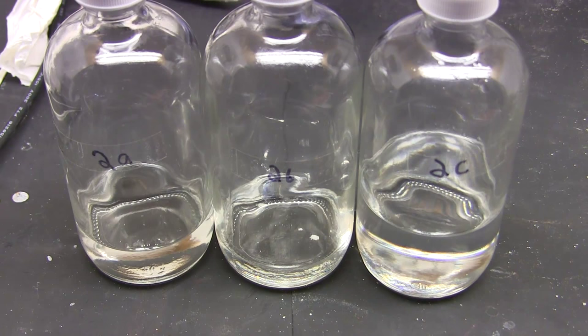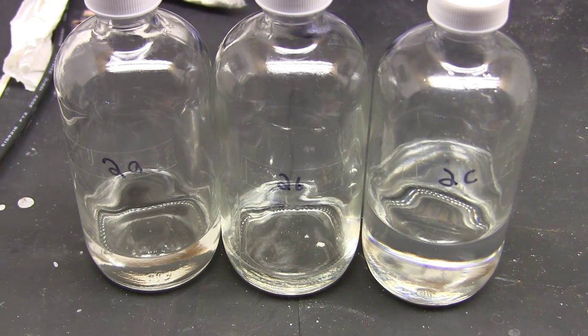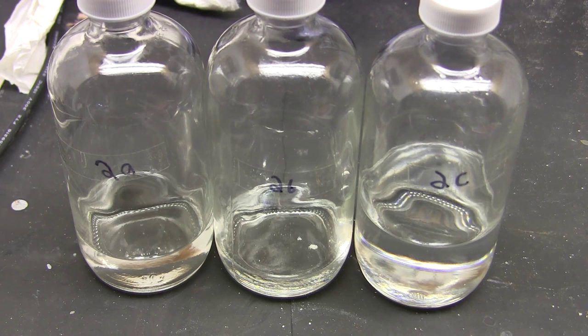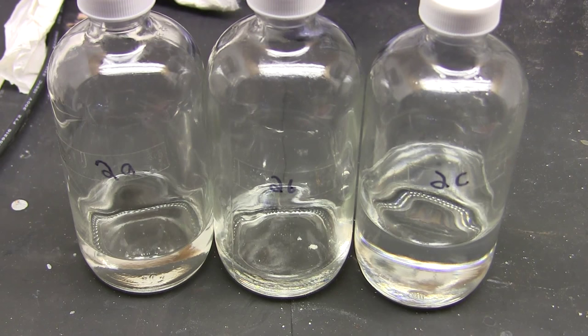And here are our fractions. 2a is the stuff that came off at 82 degrees celsius, whatever that is. Fraction 2b is the overlap of 2a and toluene which is very little. And 2c is our extra toluene. The insulated column really did help.